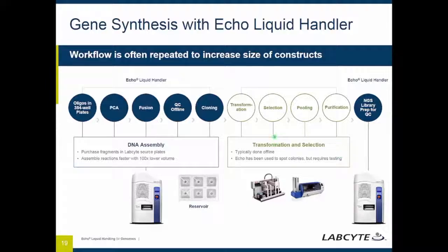Now, typically, we're going to hand this off to another liquid handler for the transformation, selection, and purification. But when it comes back, you're able to do the NGS library prep for QC or other means of quality control for your constructs generated.